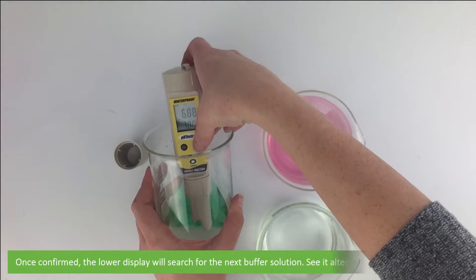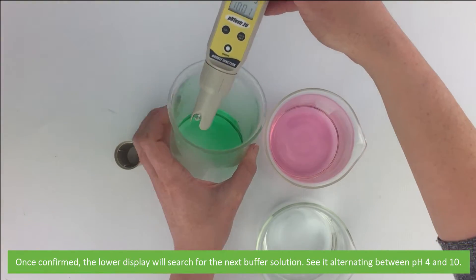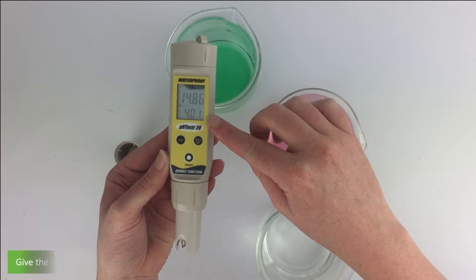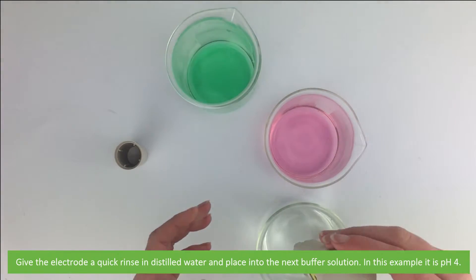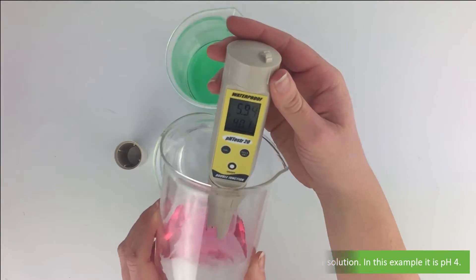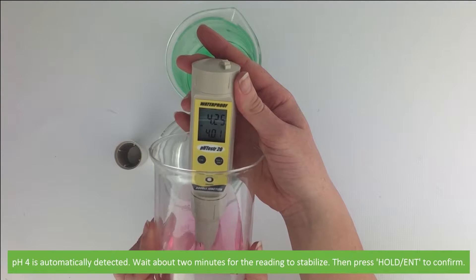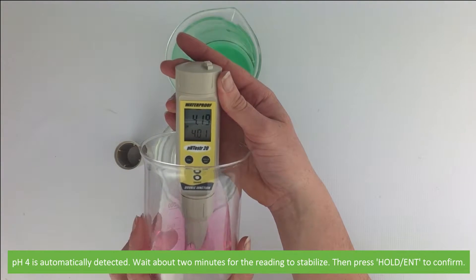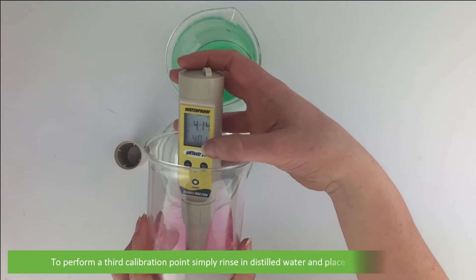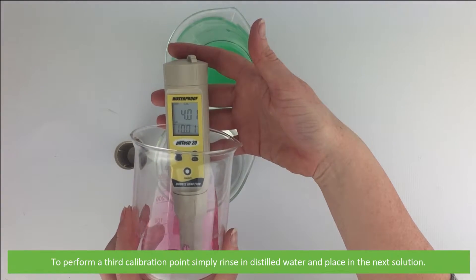Once confirmed, the lower display will search for the next buffer solution — see it alternating between pH 4 and pH 10. Give the electrode a quick rinse in distilled water and place into the next buffer solution. Wait about two minutes for the reading to stabilize, then press Hold/ENT to confirm. To perform a third calibration point, simply rinse in distilled water and place into the next solution.